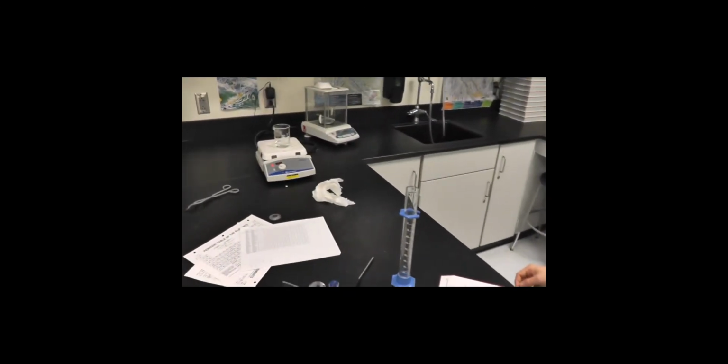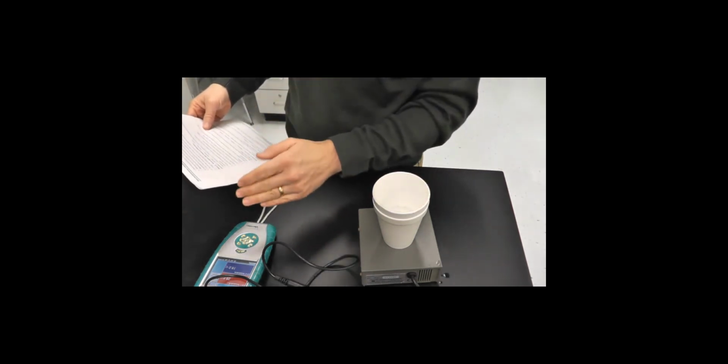The next thing is over here, I've got some water on a hot plate. As you look at the next several steps, heat some water to about 70 degrees, and measure out 50 mils of this 70 degree water into a graduated cylinder. Then we're going to record that temperature. So we're going to know the temperature of our cold water and our hot water to start with.